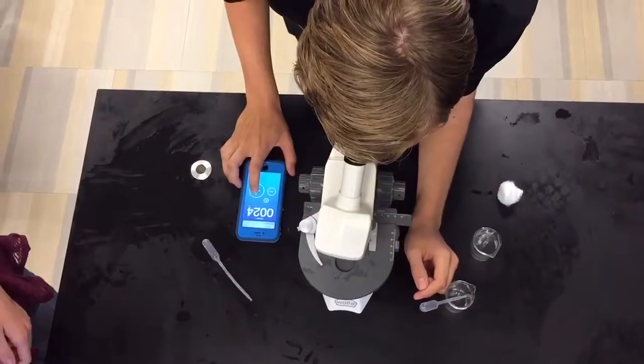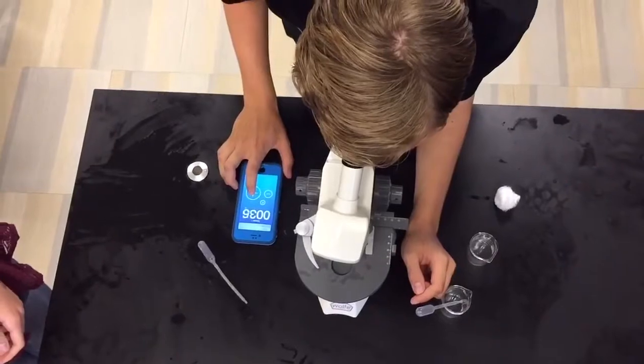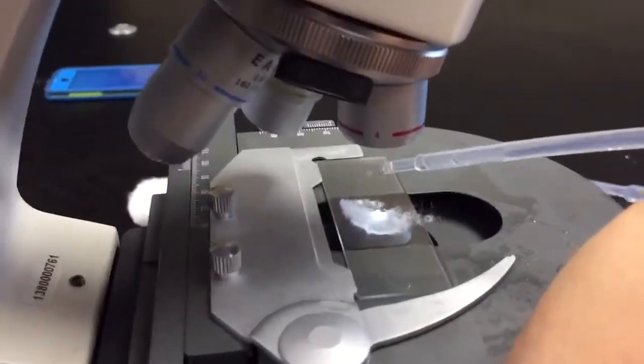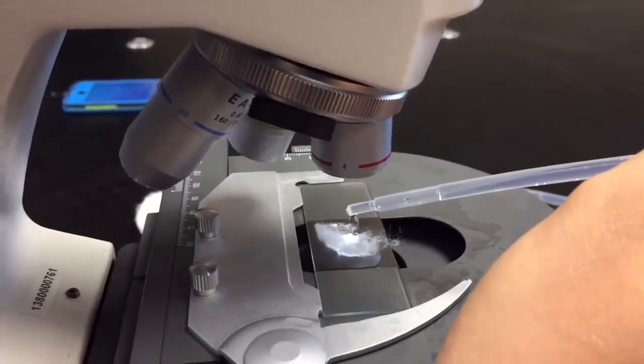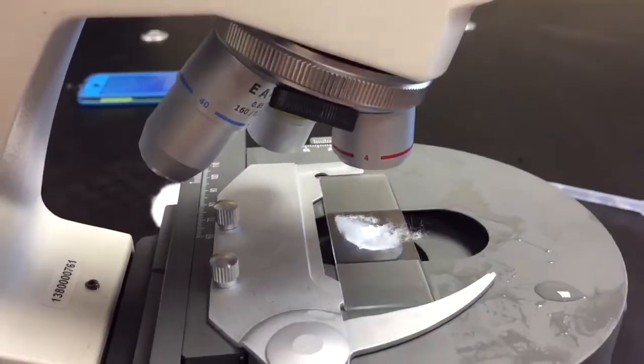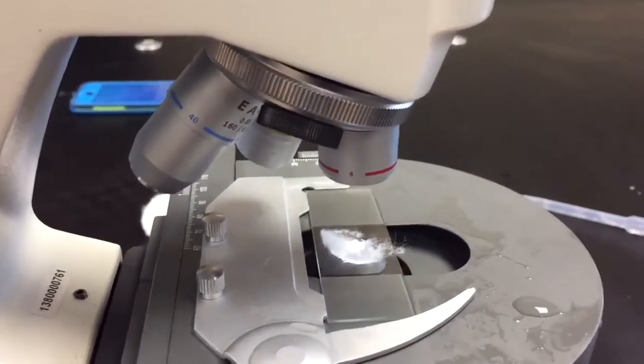Ali is counting the amount of beats per minute that the Daphnia has so we can collect our data accurately. After you've recorded the results with the water, now add a couple drops of one of the solutions to the Daphnia. Wait 60 seconds after you've added the drops and then count the beats per minute again.